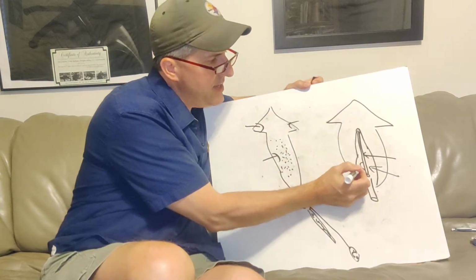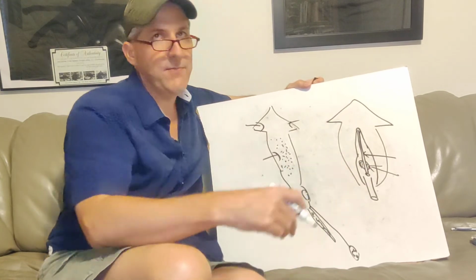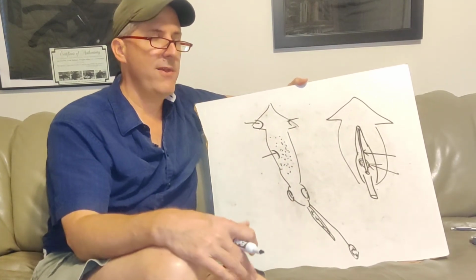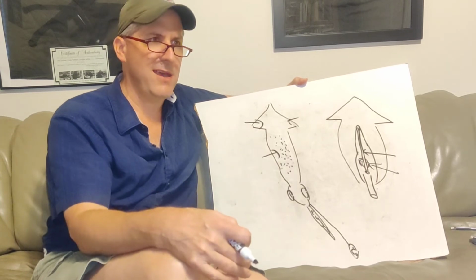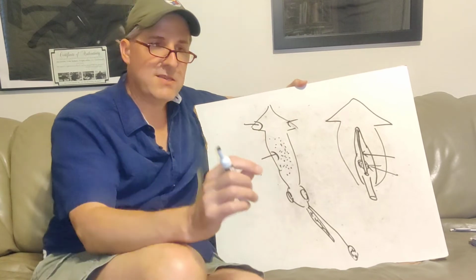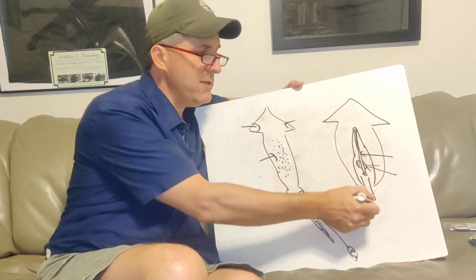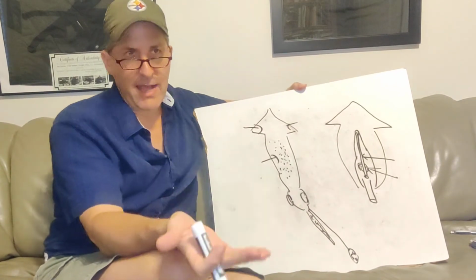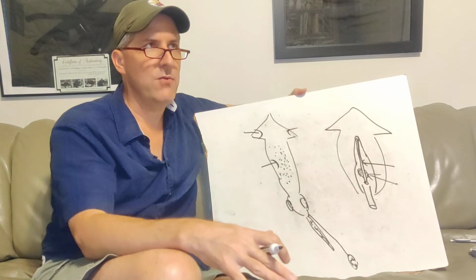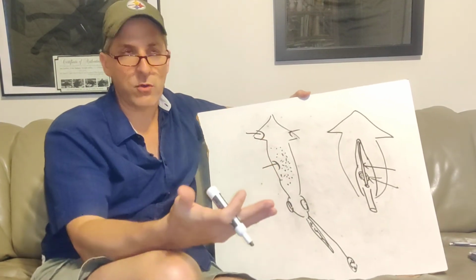Right around this area right here, it's going to look almost like a bruise all around it. That's the ink sac. People, when they do dissections of a squid, they get so disappointed. They think for some reason when you cut the ink sac, like a fountain pen, it squirts ink at you. No. When you cut it open, basically it has little tiny crystals in it. When the crystals get combined with the water that's being expelled, that makes the ink. That's then going to be your smoke screen, if you will, in order to get out of Dodge if you were startled. Okay?